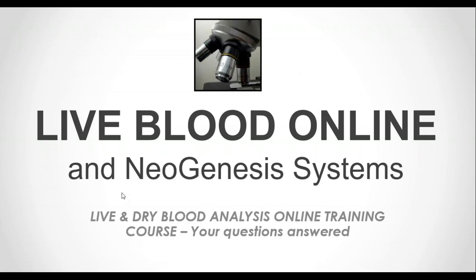It's actually possible to go through the lessons and learn all the theory before going on to the practical aspects, where a microscope will actually be needed. Many attendees do it this way, but it is important to mention that we only issue a certificate to an attendee after reviewing their case studies. To complete your case studies, you would of course have to have access to a microscope.